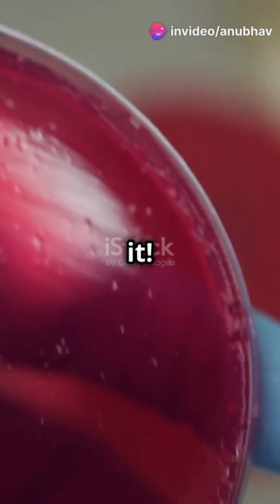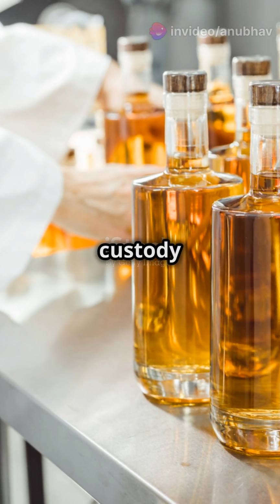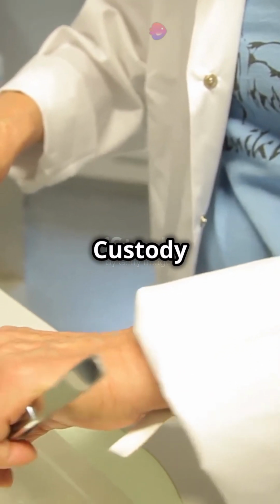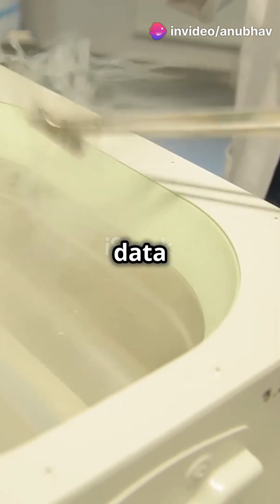And there you have it. By following these steps, you can ensure that your lab's chain of custody process is both effective and efficient. A clear, concise chain of custody process ensures your samples are secure and your data is trustworthy.